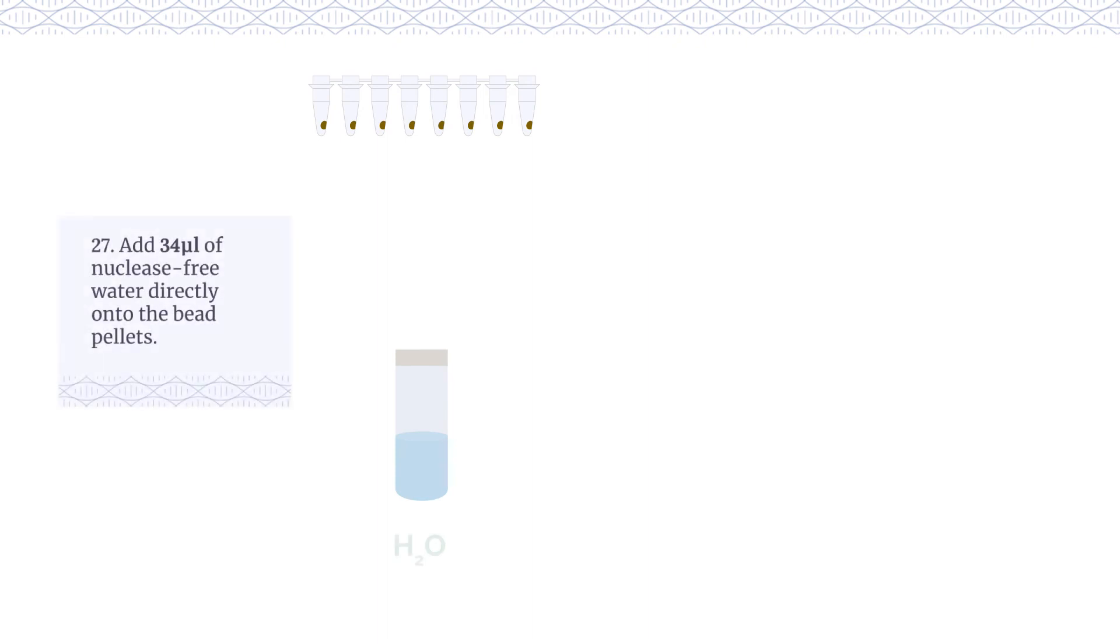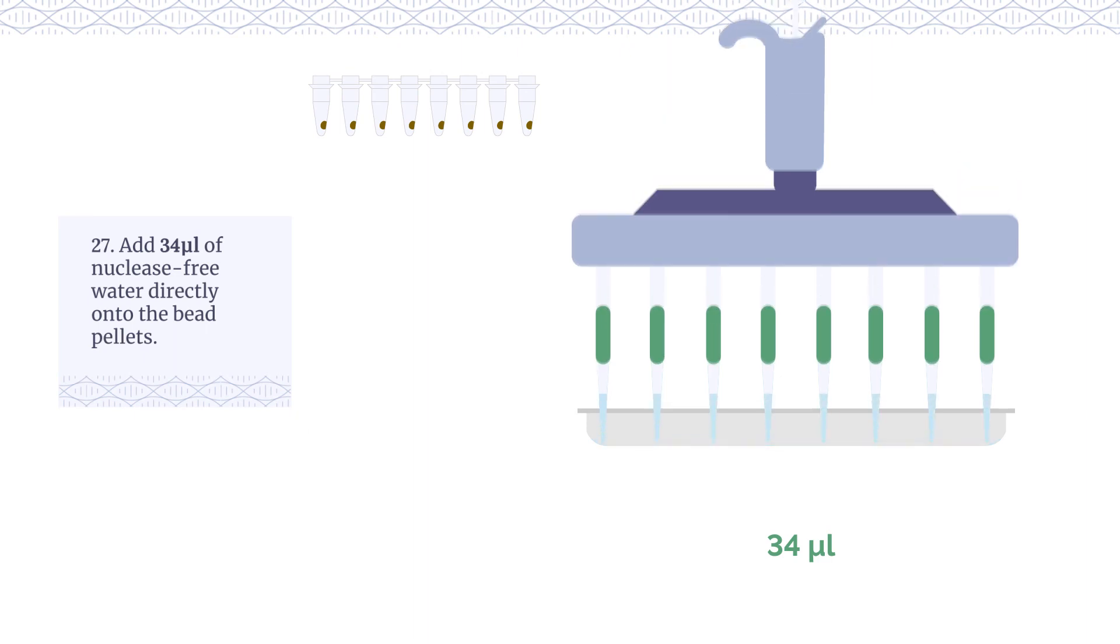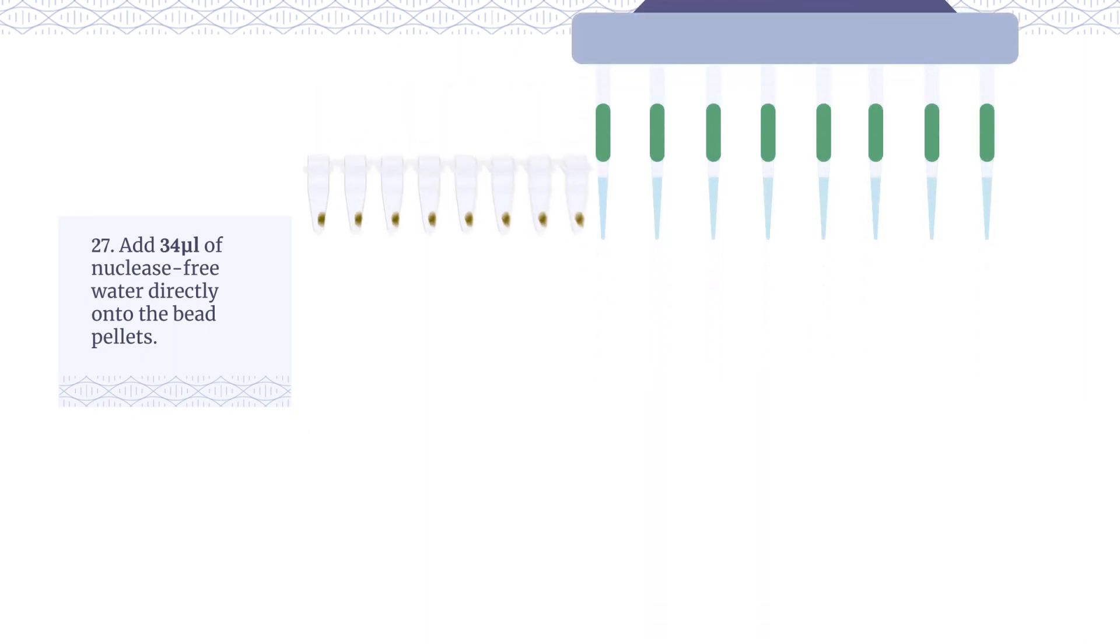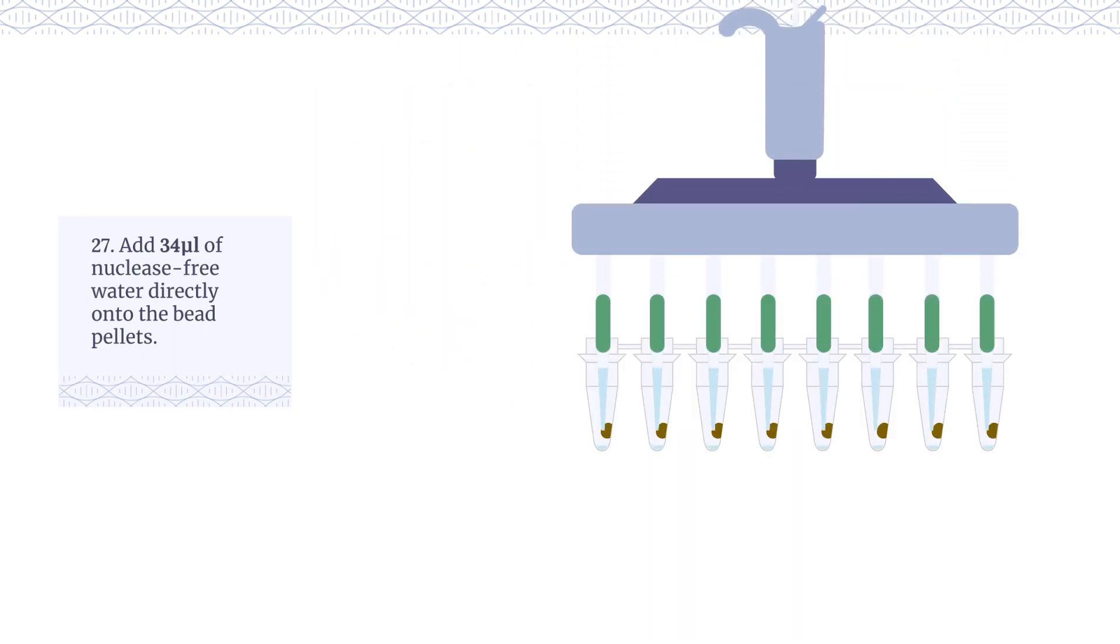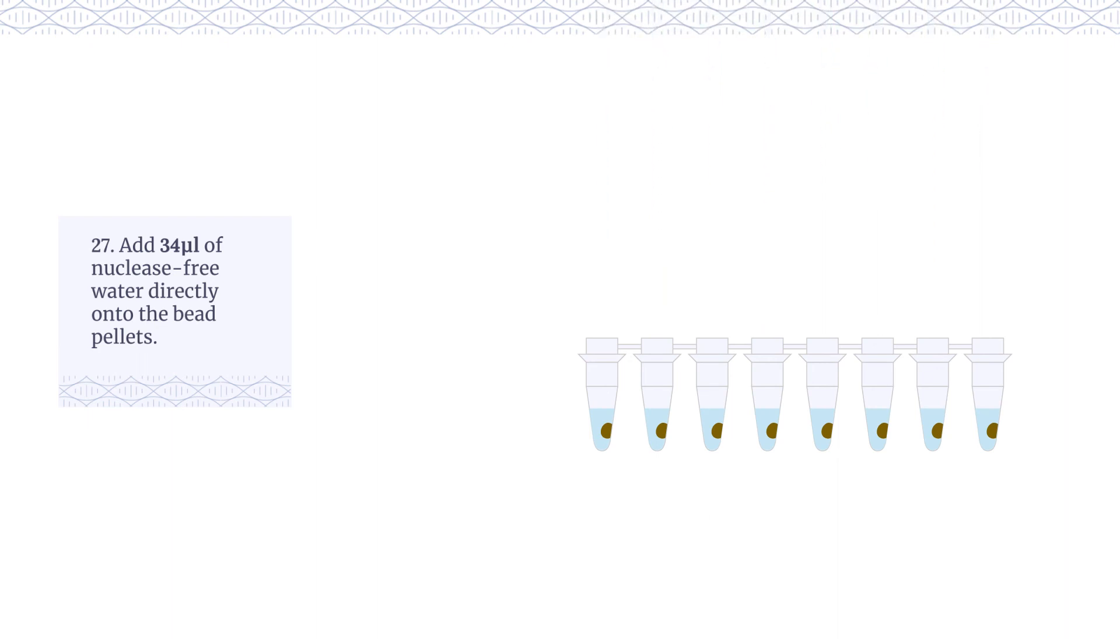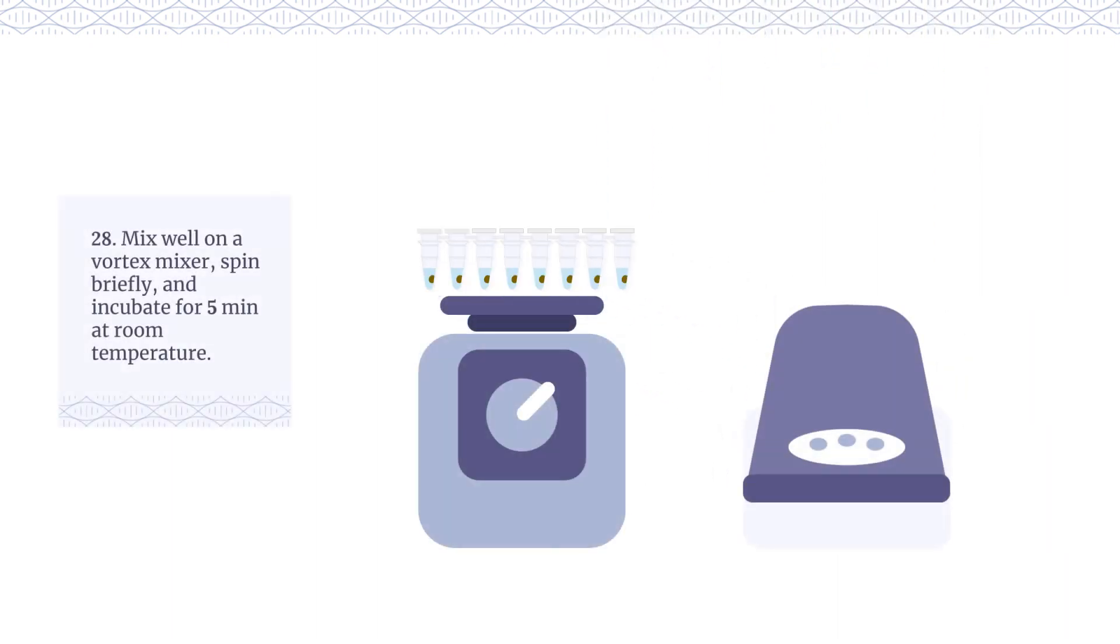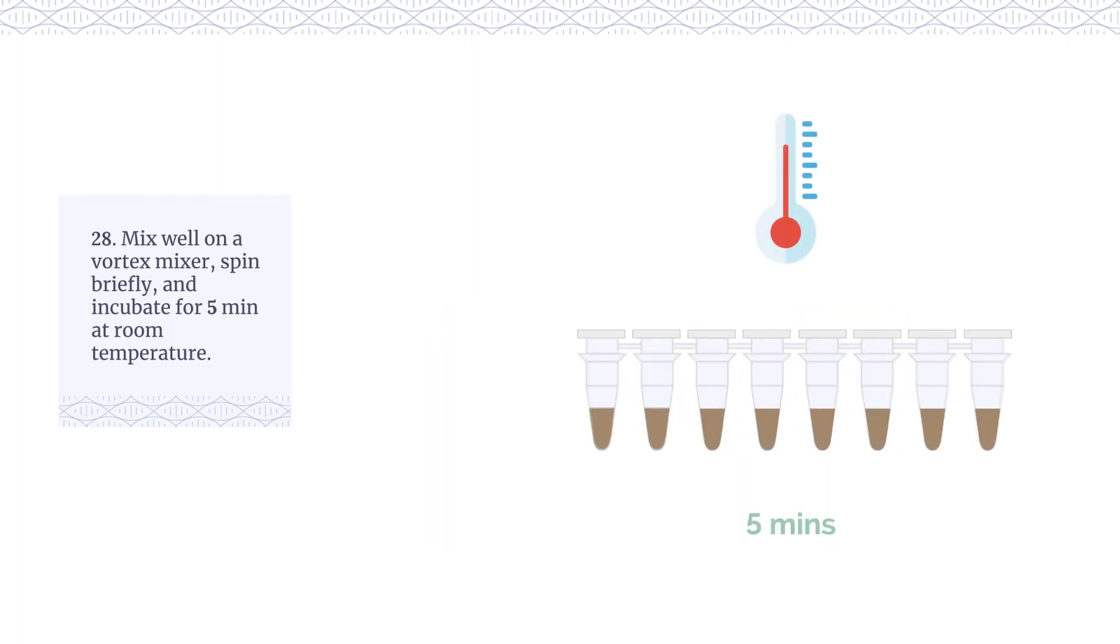Add 34 µL of nuclease-free water directly onto the bead pellets. Mix well on a vortex mixer. Spin briefly and incubate for 5 minutes at room temperature.